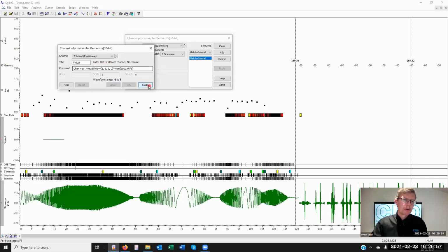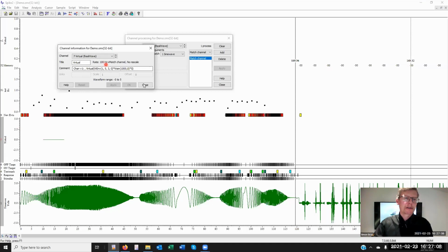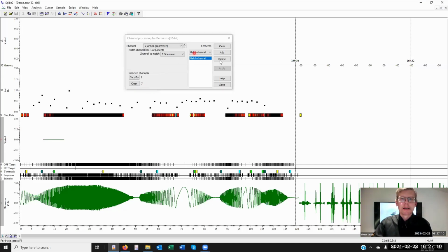There we go. But we've lost all the information. That was a very fast sine that I'd put in there. So not 100% convincing, but the channel is at 100 hertz, and that's going to allow us to average both of these. Not that I want to do that now, though.